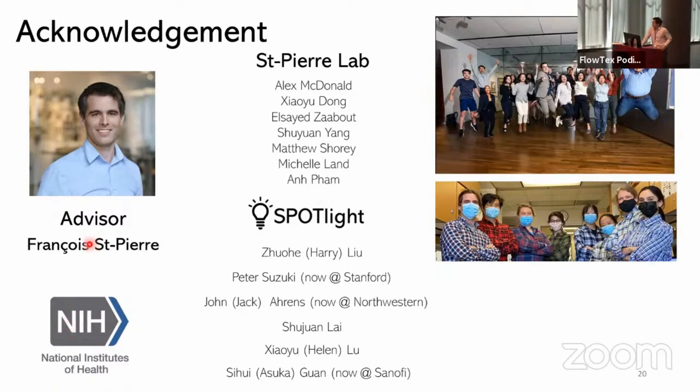Thank you very much. That was a really interesting talk and an interesting technology. We have one question from the online chat. The question is, how much time is needed from the light tagging to FACS sort?